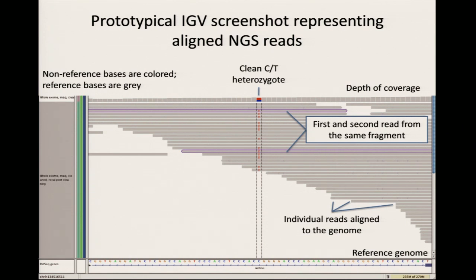The horizontal lines, all these horizontal lines here, are the reads. They're like the little things that you read off, and they're just laying there, right? And when they're gray, what that's saying is that those bases match the reference. There's no reason to worry about them because they just match the reference. And you have the reference down on the bottom. There's all these little letters, A, C, T, and G. They're colored for you so you can pick them out. And they're just there, and they all match, and that's great.